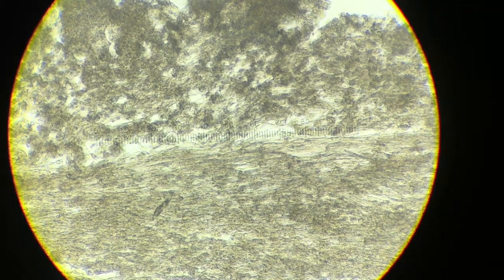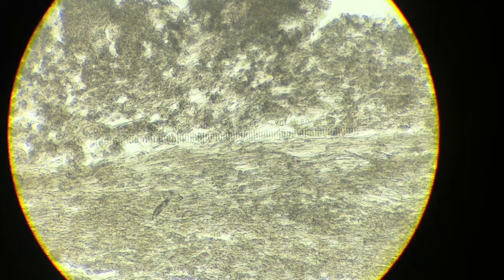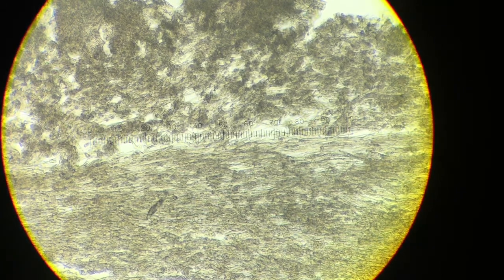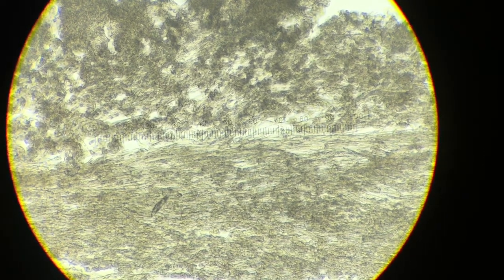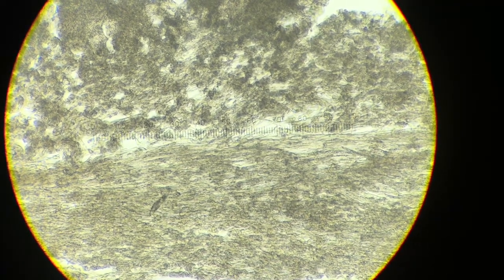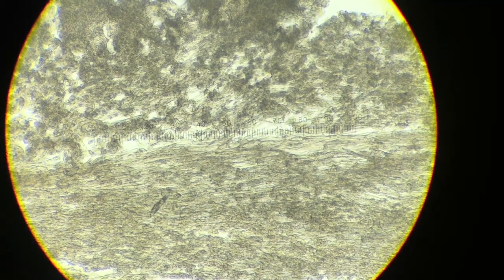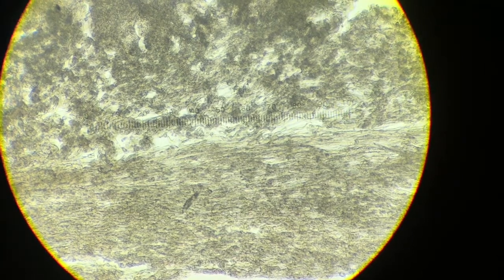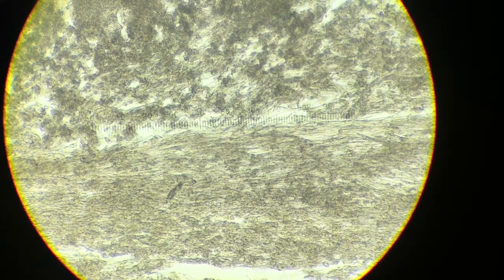Before I go into more details, I would like you to just look at the two distinct zones, the top zone and the bottom zone. I sort of placed the eyepiece micrometer dividing these two zones in case you're having difficulty spotting them. So above, we see darker, seemingly more disorganized cells in clumps. And below, we see a lot of filamentous hyphae that on the screen run from left to right, right to left. Keep in mind that the section was made radially, so if there is a radial orientation to the hyphae in the context, this is what you should see. So in Amanita, it's important to get sections that are thin enough that let you see the orientation. It's important to keep in mind radial orientation as well and follow radial sectioning.